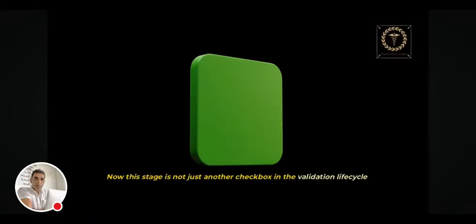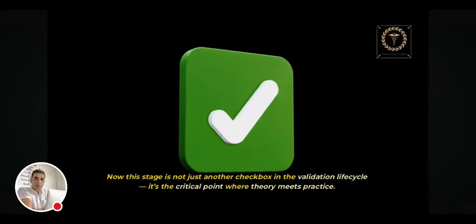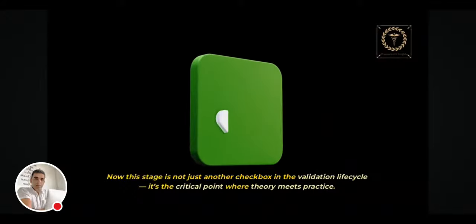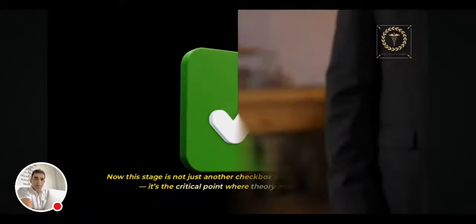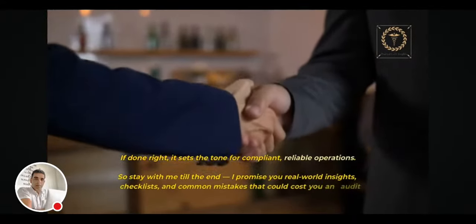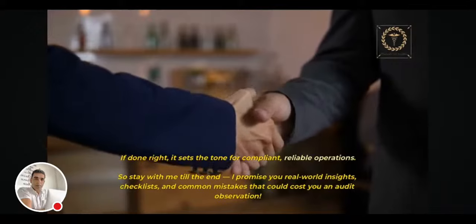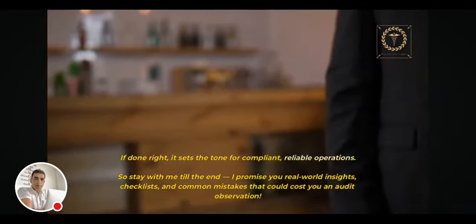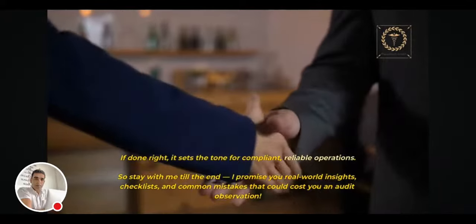Today, we continue our equipment qualification series by diving deep into installation qualification, or simply IQ. Now this stage is not just another checkbox in the validation life cycle, it's the critical point where theory meets practice. If done right, it sets the tone for compliant, reliable operations. So stay with me till the end. I promise you real-world insights, checklists, and common mistakes that could cost you an audit observation.